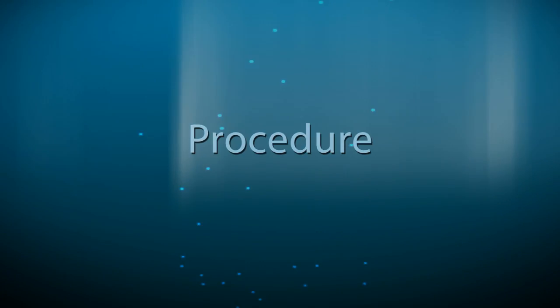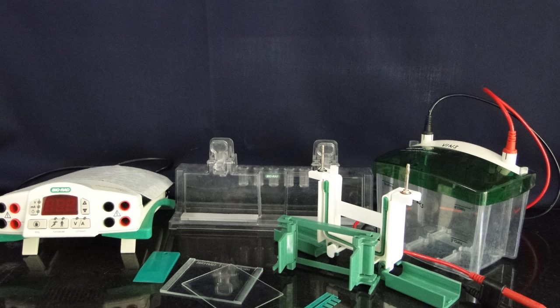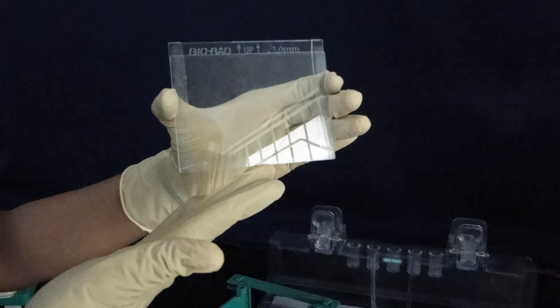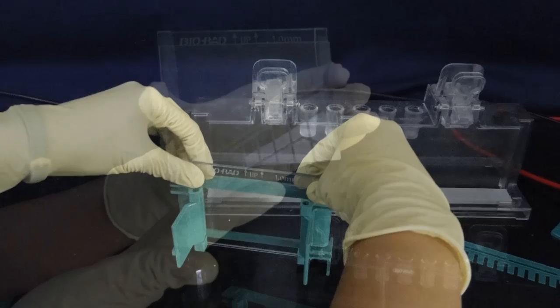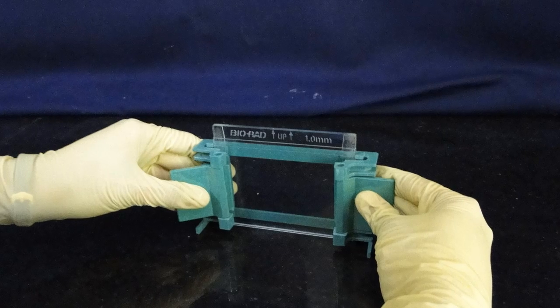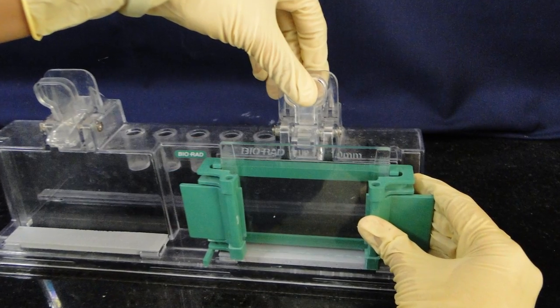Procedure. The experiment begins by assembling the glass plates on a clean surface. Lay the longer glass plate down first and then place the shorter glass plate on top of it. Embed them into the casting frame and clamp them properly. Make sure that the bottom ends of the glass plates are properly aligned, then place the frame on the casting stand.